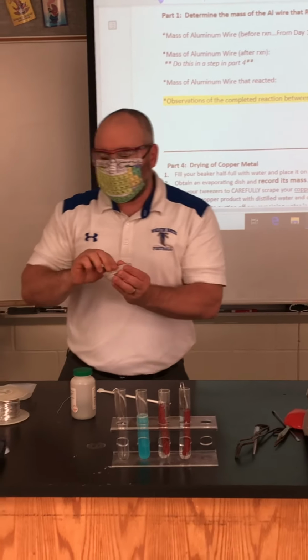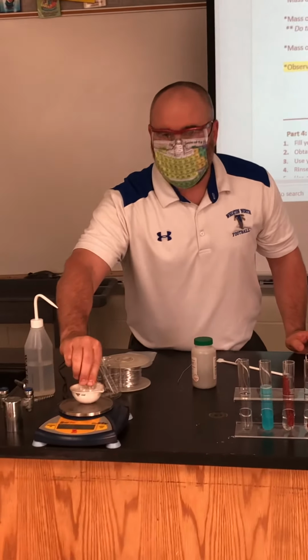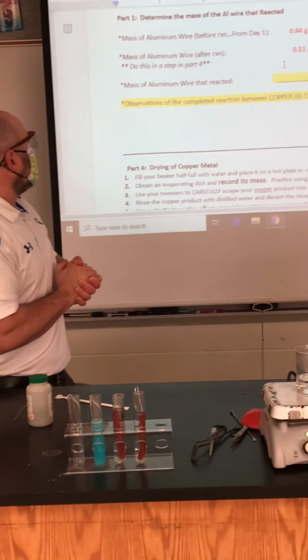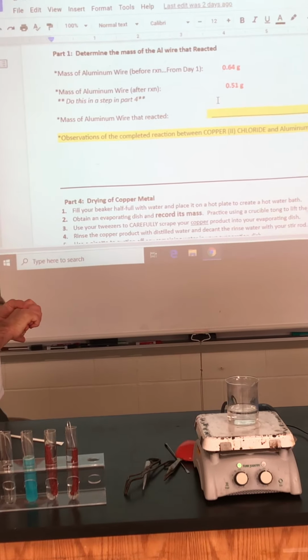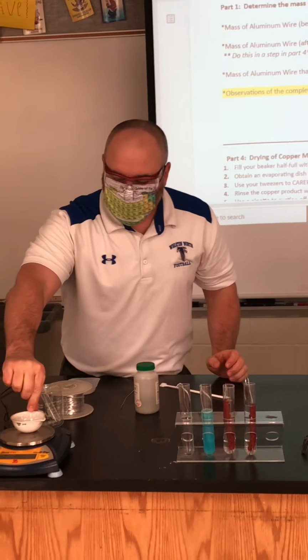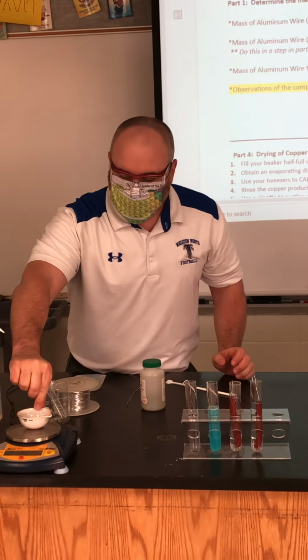Now prior to doing that, I'm going to get the mass of this evaporating dish because we'll need it for later. I've recorded that mass for you later in the lab. So then what we're going to do is the following.